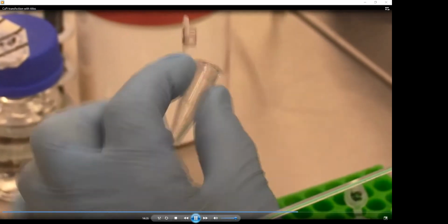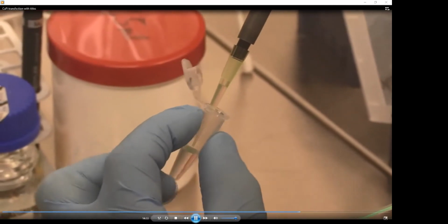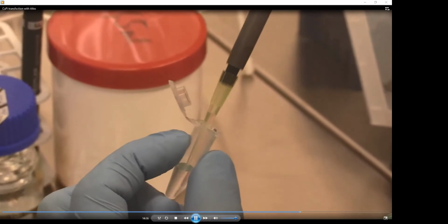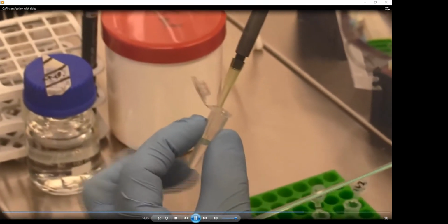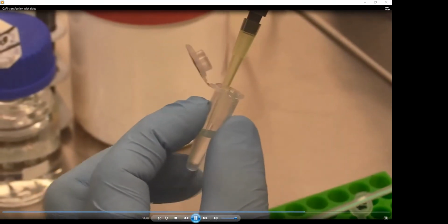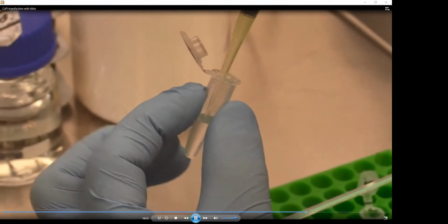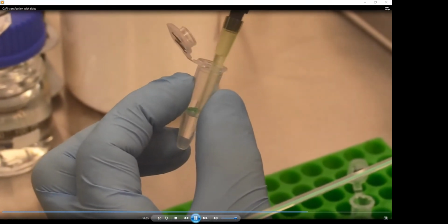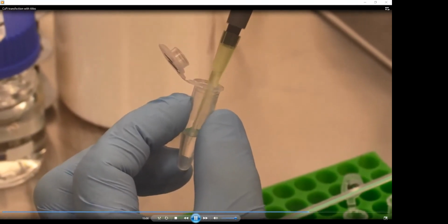So I'm showing it in detail because you have to be really careful to collect all the solution which you have prepared. It has to be in a 1-to-1 ratio. And here you have a small advantage to the normal course because you can see everything in detail. When there are many participants in the course and only one is pipetting, the rest has to watch it, and it cannot be so nicely visible as in the zooms of the video.